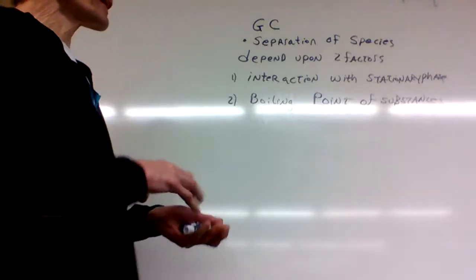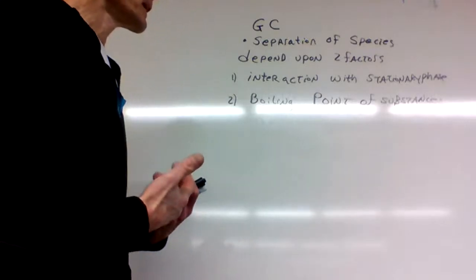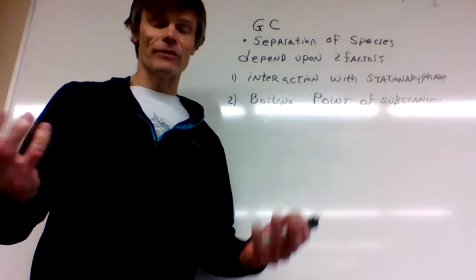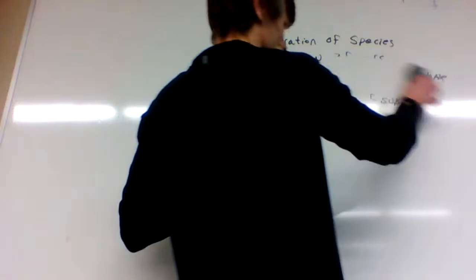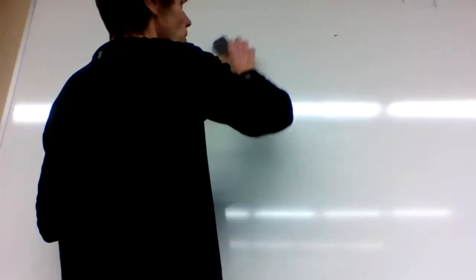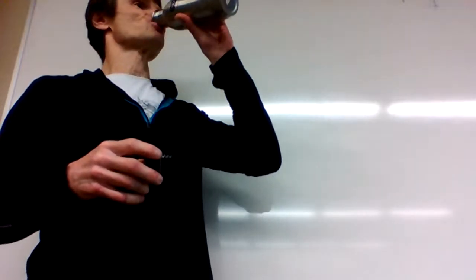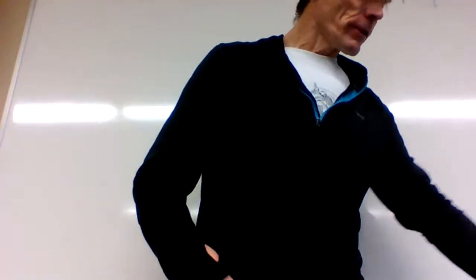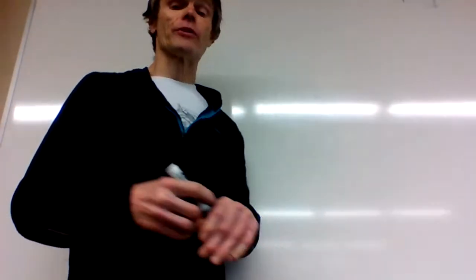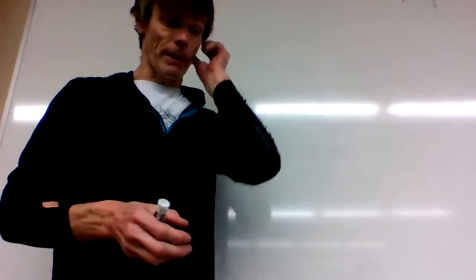So let's think of an experimental situation that you guys would have been dealing with in Quant Lab, the last exercise you would have done. Let's look at a little exercise here. And we're going to look at 3 species, 3 organic compounds, and we're going to answer some questions about them. So we're going to think of 3 compounds that we're putting into our GC experiment, and we're going to look at some data and make some decisions about our data.